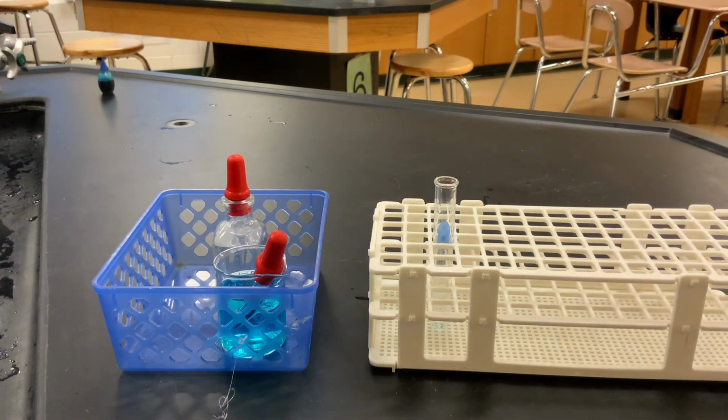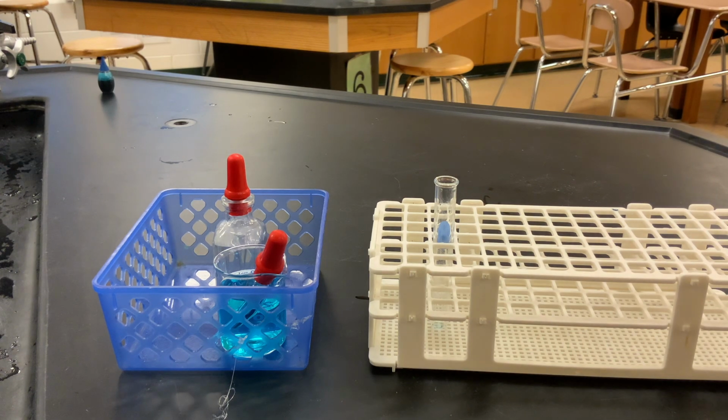Right now there's only two things in there. There'll be a total of 5 things that you'll test with, and they'll all be labeled. But just so you can see what's happening, the blue substance is water. The water is going to be dyed blue. Just put a little bit of blue food dye in there, because that's going to help us with the dissolving and mixing that we're trying to see in terms of solubility. So that's going to be in there, that's blue. Everything else will be labeled. So just pay attention to the water being blue.